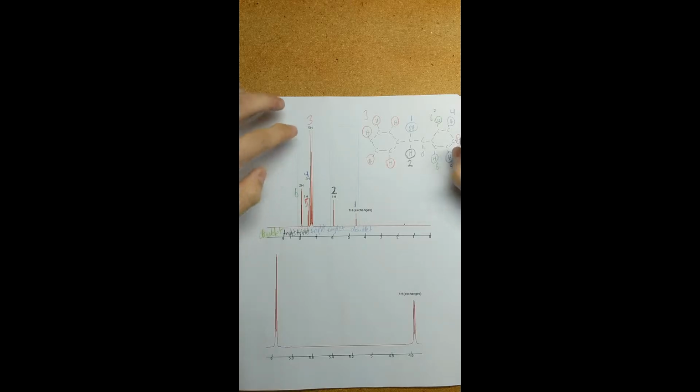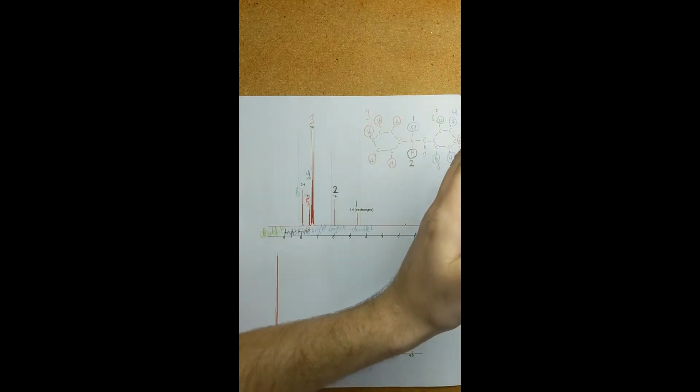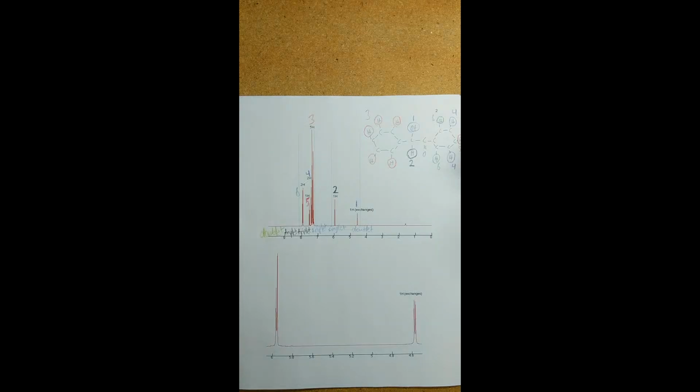The first thing I want to look at and point out is wherever it says 2H, 1H, 2H, 5H, etc. Those are our integration numbers, and if you add all those together, they should add up to 12 to match our number of hydrogens in our formula, and they do correctly, so that's perfect. And now to begin going through the deshielding, the furthest right or upfield is the least deshielded, and the furthest left or the most downfield is the most deshielded.